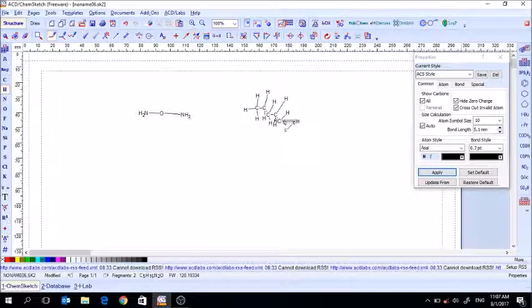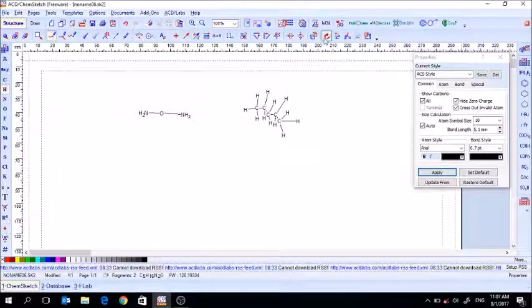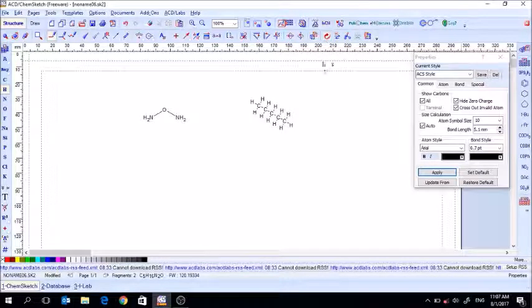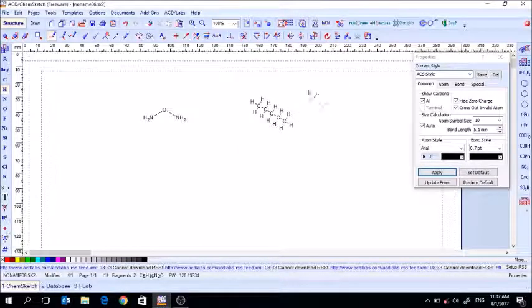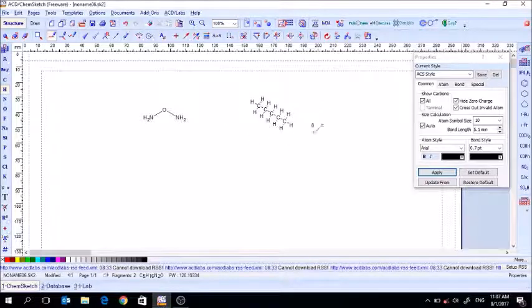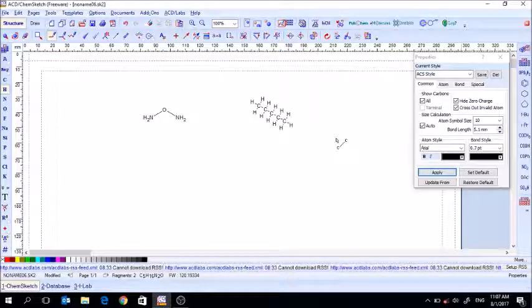Once you've replaced all the hydrogens manually, hit Clean Structure again and you can see it looks much better — much more like the structural formulas you're accustomed to seeing.